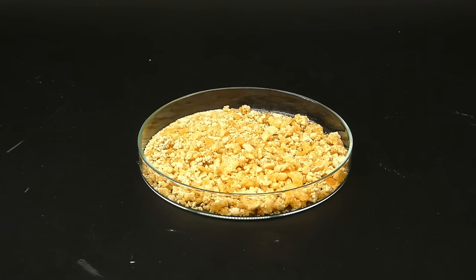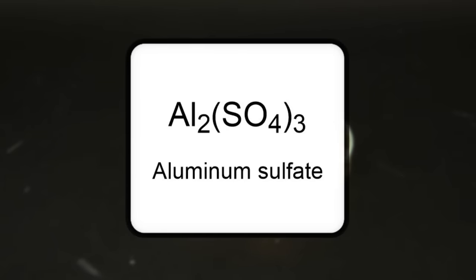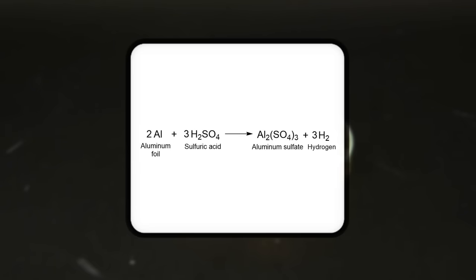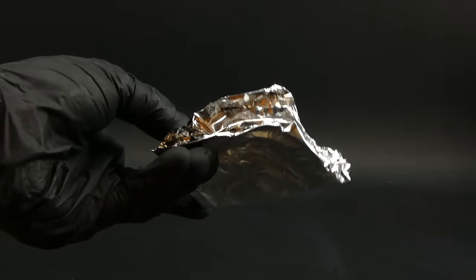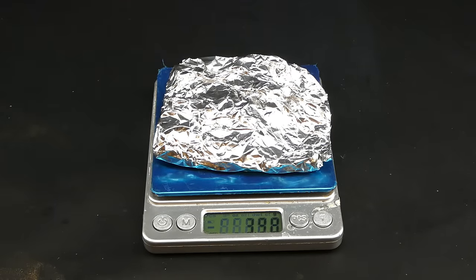It of course isn't completely pure as you can probably guess by it having this awful yellow color, but it should work alright for making the alum. And speaking of that, now with the potassium sulfate ready it is time to take care of the aluminum one. Making it is a bit tricky but similarly to the potassium sulfate it doesn't require any weird reagents. And all that I am going to need is some aluminum foil and my trusty sulfuric acid.